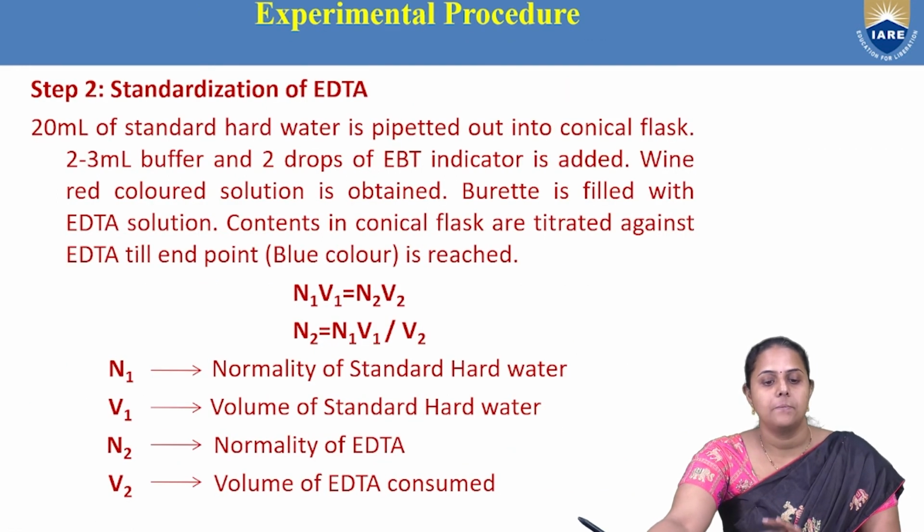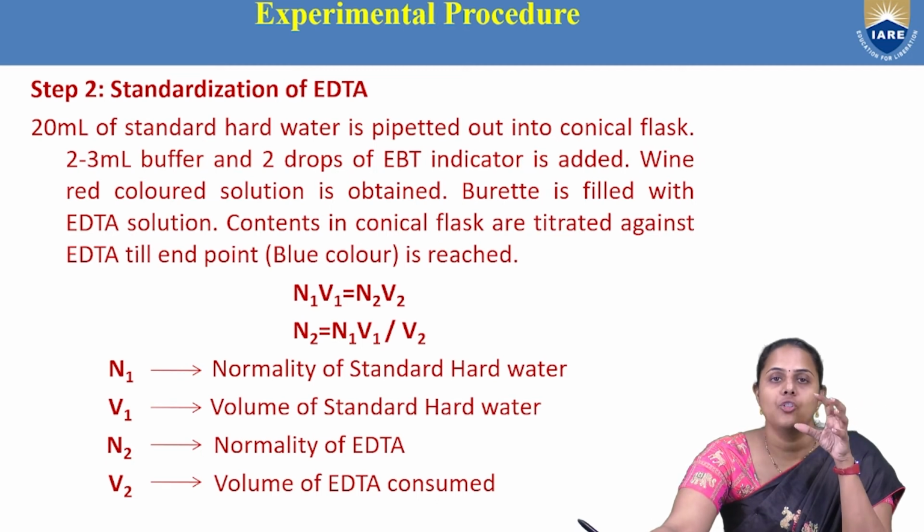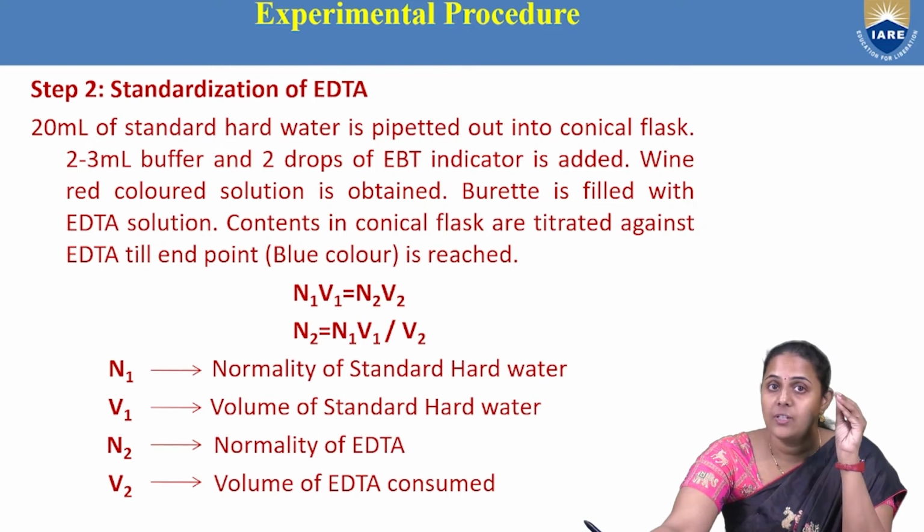Next step is standardization of EDTA. Standardization of EDTA means in this step, by using the calcium carbonate solution which we prepared just now, we will be finding out the concentration of EDTA. EDTA is a secondary standard.